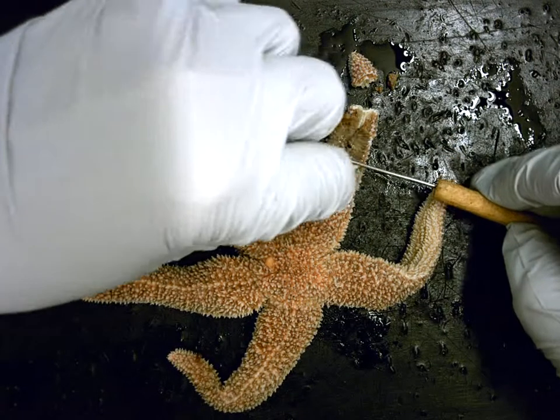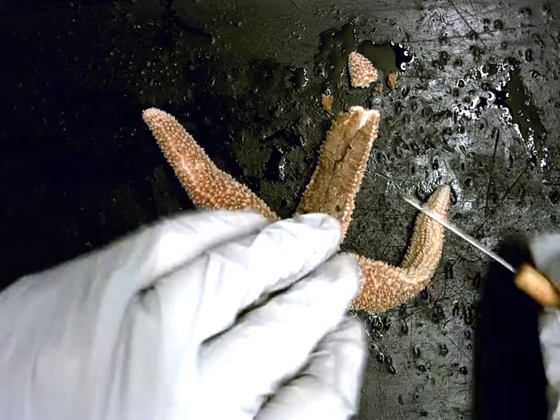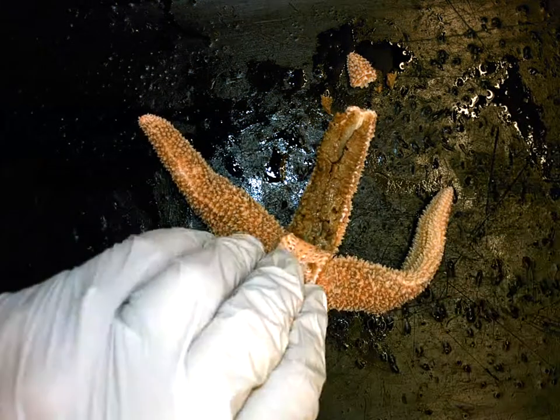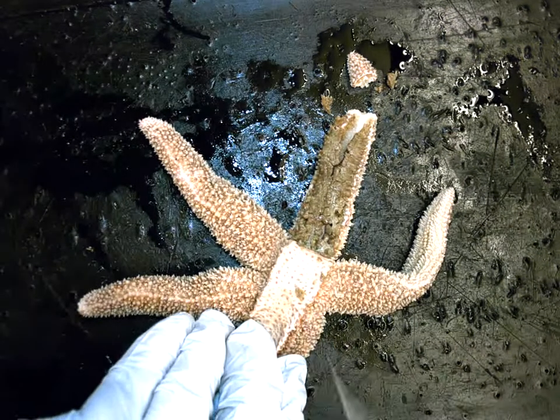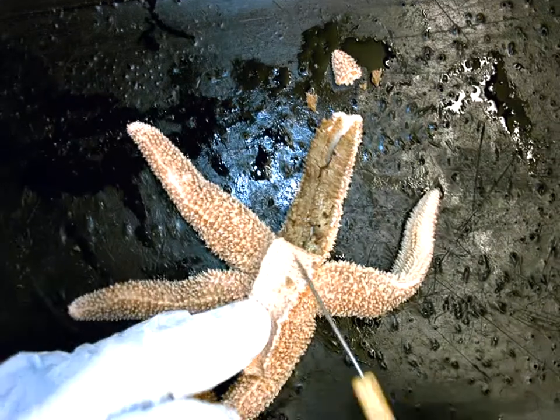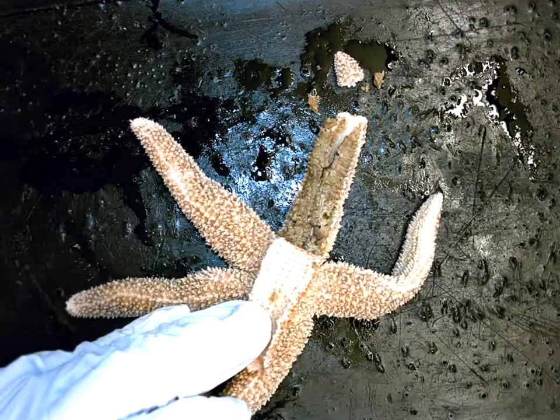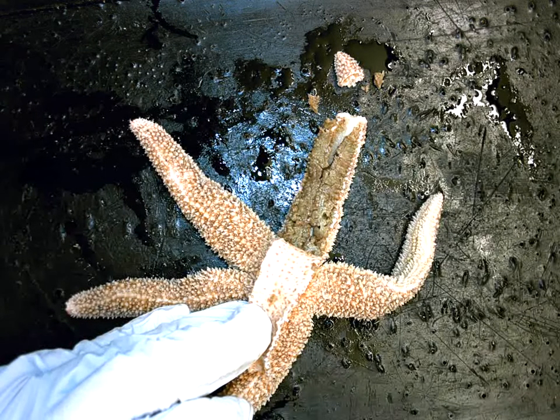As I fold back the arm, you can see there are these two organs lying in the arm of the sea star. The other thing I want to point out is that this is the inner wall of the body cavity, or coelom, and it has a shimmer or sheen to it. That's because the body cavity is lined with a layer of epithelium that seals it, just like in the segmented worm and in us — and this layer is known as the peritoneum.